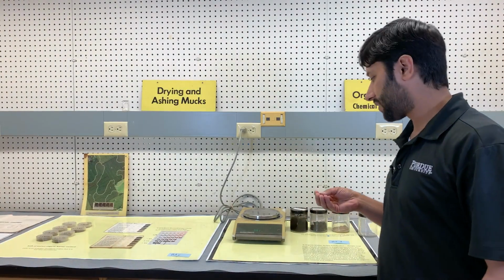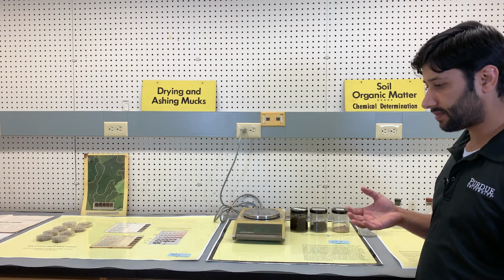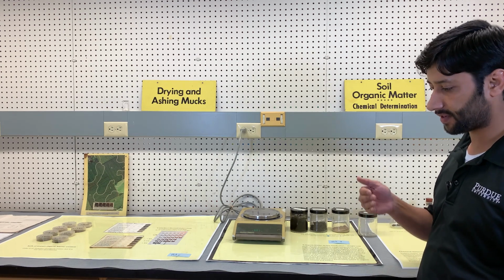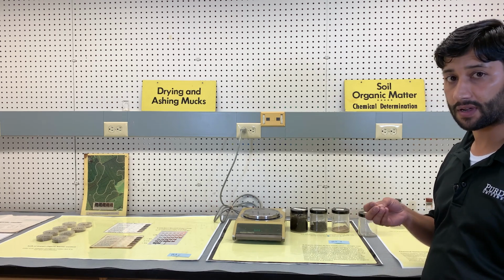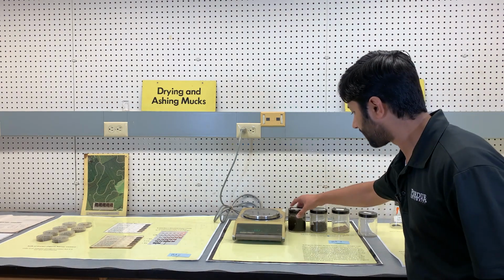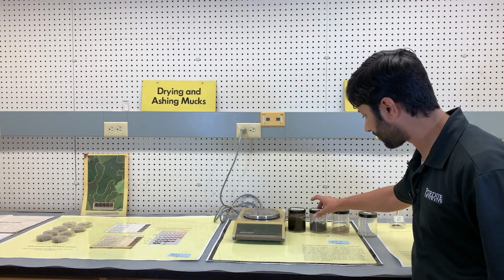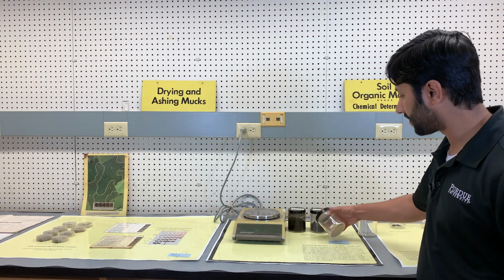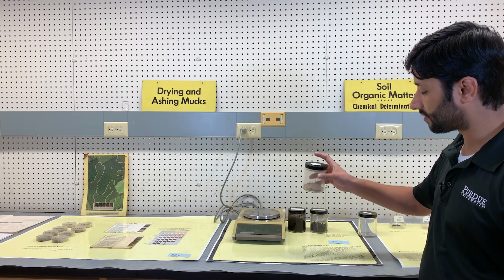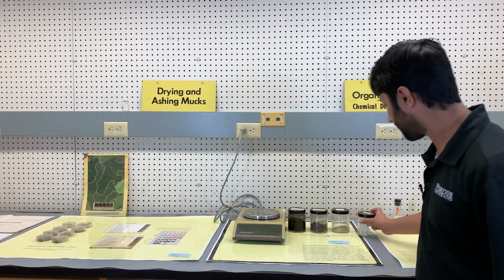The next method to determine the organic matter content will be based on the dry combustion method. In this method, we are trying to burn all the organic matter from the soil, and based on the difference of the weight, we will be able to determine the organic matter content of the soil. So this is the field moist organic soil, and then we place that soil in the oven, and this is the oven dry soil, and then finally we place the oven dry soil under high heat, and all the organic matter is burned off, and we are left with the soil here.